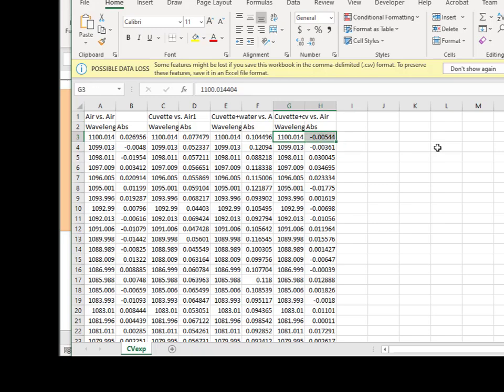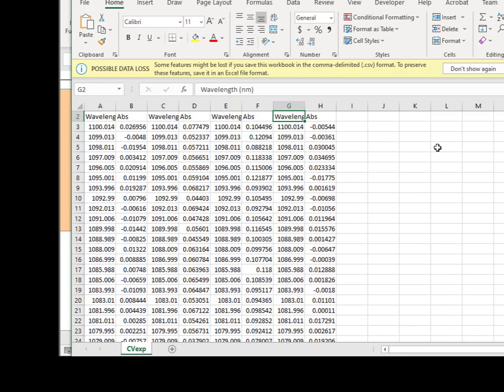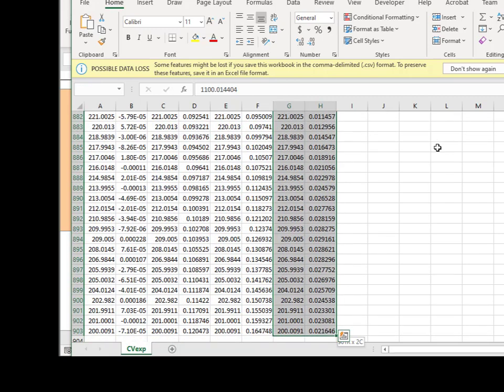a little mistake there. The way I do this is I hold the Shift key down, I put the cursor on the first number that I want to copy. I hold the Shift key, I go right 1, and then I hold the Control key, and I go down, right, all the while holding Shift.